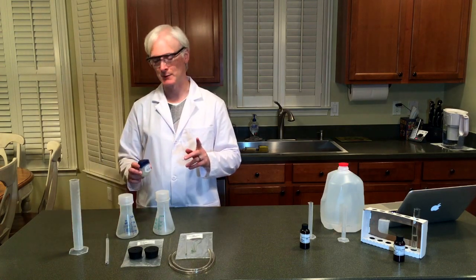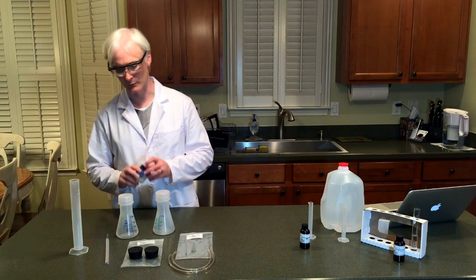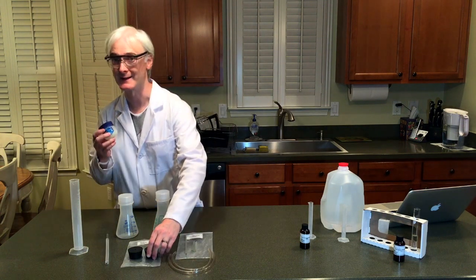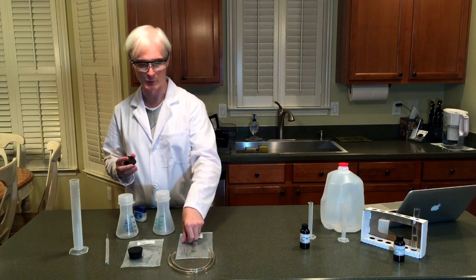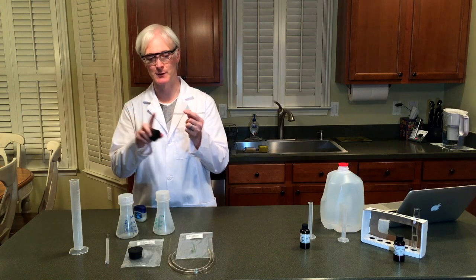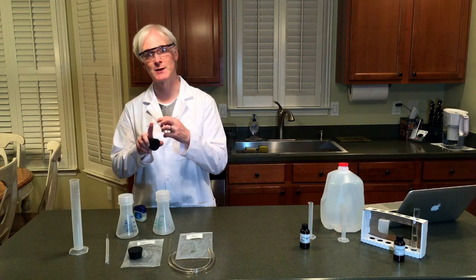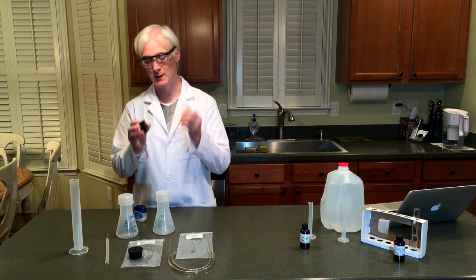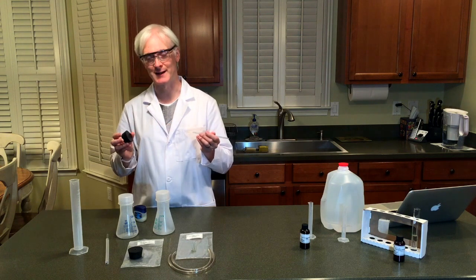Now, things can be tricky. I've got some petroleum jelly here that I like to use — it's actually necessary to use it for these stoppers. When you're inserting the glass tubing into the stopper, put a fair amount of petroleum jelly on the end of the glass tubing before you put it in. Otherwise, you will not be able to get it out.